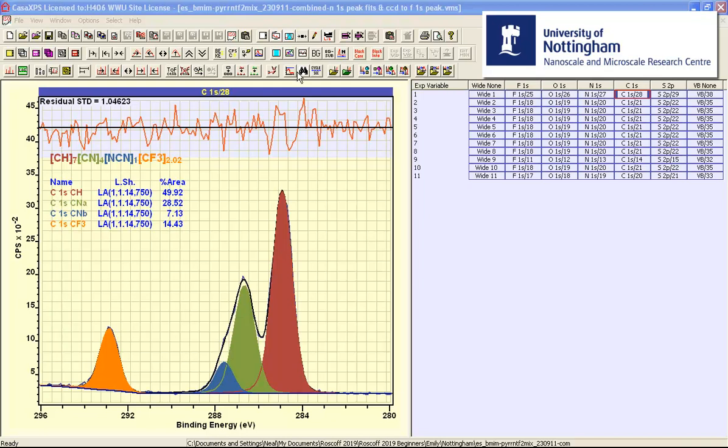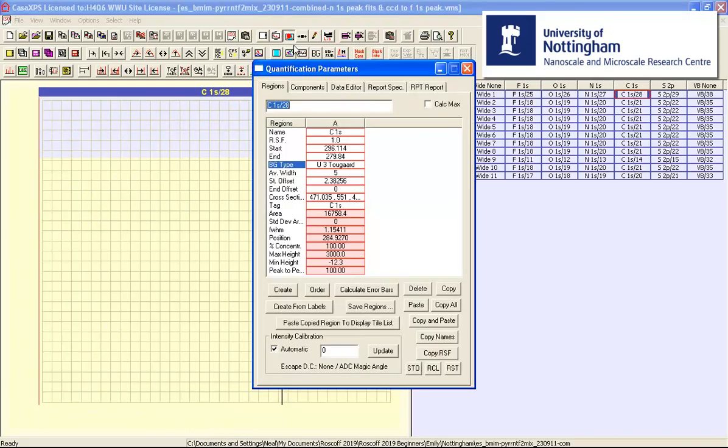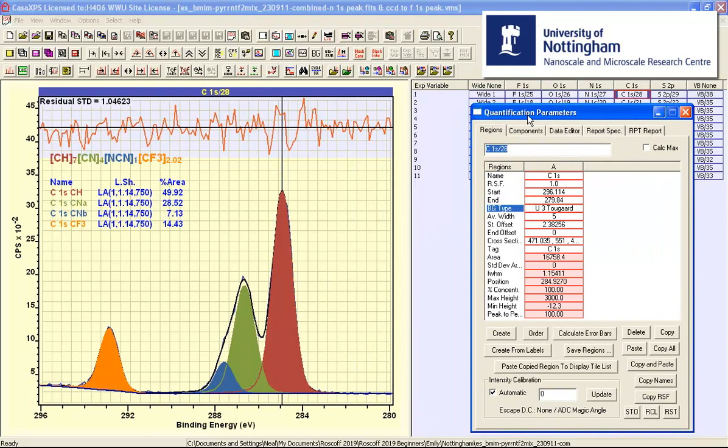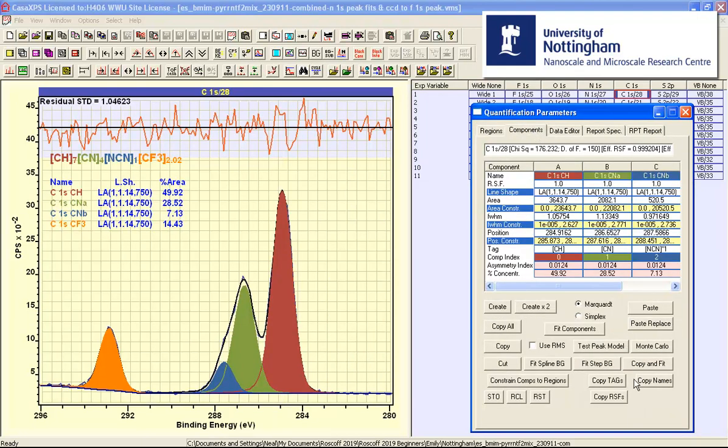There are two options on the components property page that is on the quantification parameters dialog window that relate to Monte Carlo. The Monte Carlo button will perform a full simulation and calculate error bars on the basis of the peak model assuming Poisson statistics.